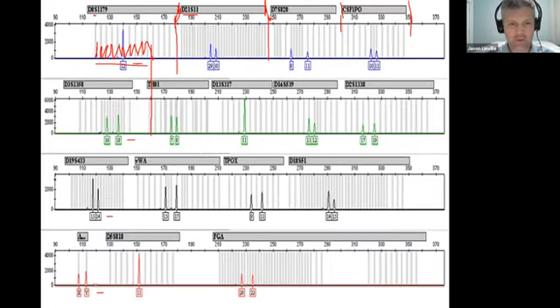The tables as far as 192 equals an 8. These gray bars here, this is actually representative of the table. What this is telling us is we ran the allelic ladder and it set all these gray bars for the day.